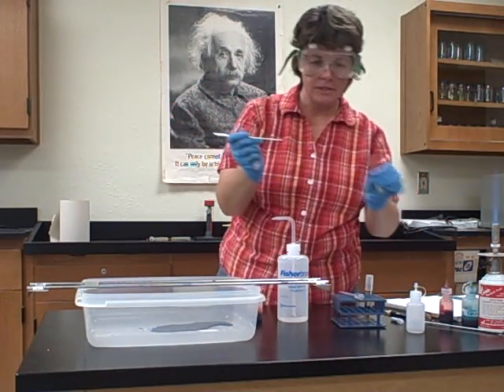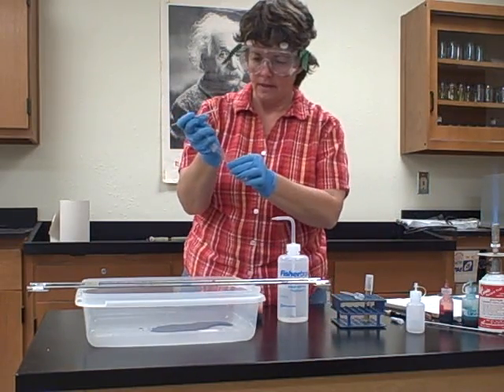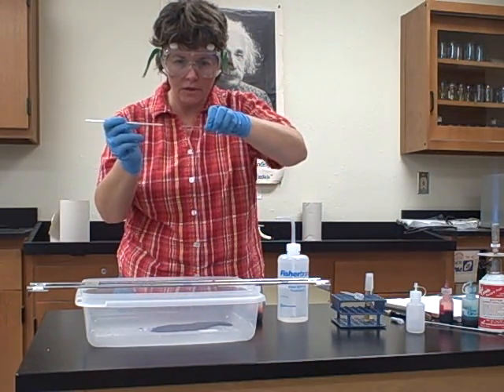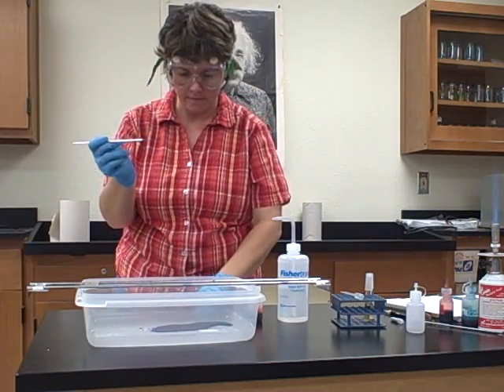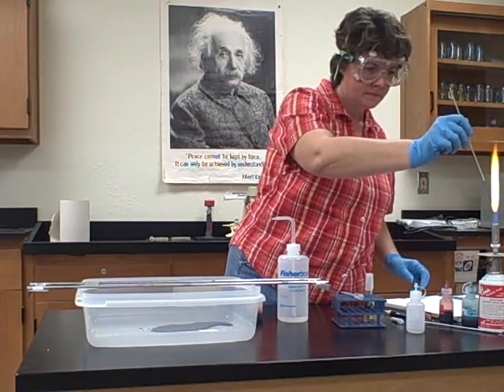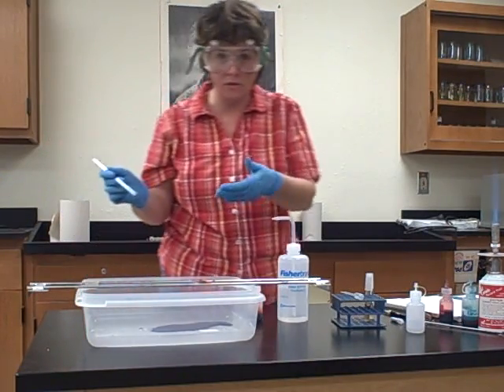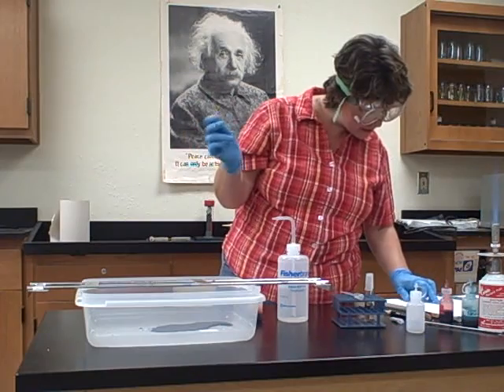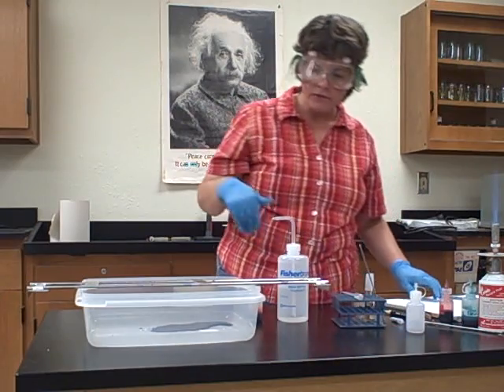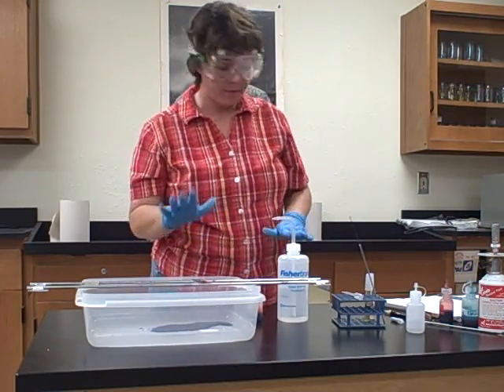So now we're going to get some of the bacteria. Okay, and then you're actually going to put the bacteria into the Congo red. I'm going to put it up here for now so that we can see what we're doing. Now you can see that the culture is red. Okay, now the next step says to let them air dry. So we would allow those to air dry. I'm going to go ahead and turn this off. After they have air dried, so this is still wet, but you would let it dry.